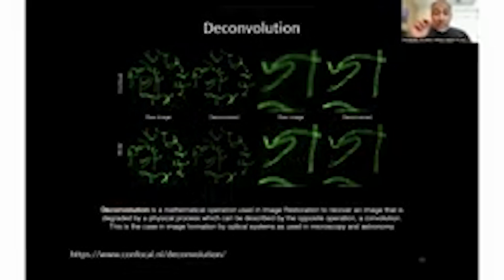What I will also say a little bit about is, along with the development in tools to visualize, there are algorithms that are written to process the image. These are mathematical algorithms that are written to essentially clean up the image, but do it keeping in mind what the fluorescence is like, where exactly the fluorescence is, what is the region of, say, bleed through in the fluorescence.